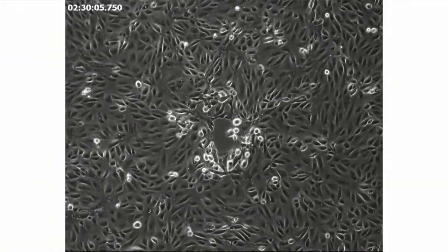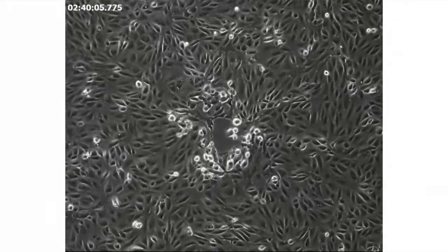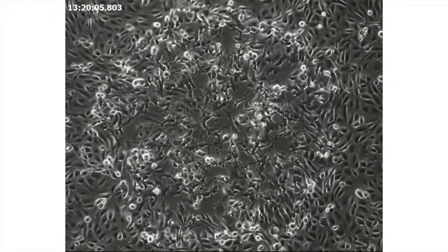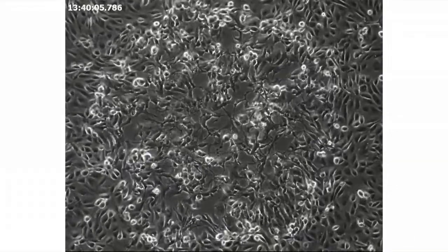Here's a time-lapse movie of a developing plaque. It was taken through a microscope, and as the cells become infected, they become shiny because the microscope light does not pass through them. You can see that over time, the cells are killed by virus infection, and the resulting plaque becomes larger as successive waves of cells are infected. I think it looks like what happens when you drop a pebble into a pond.